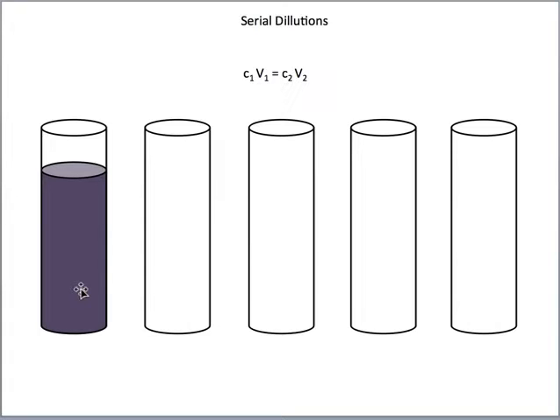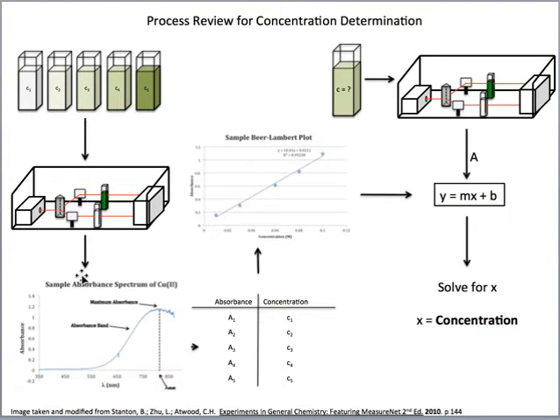Exactly what that new concentration is will depend on how much solvent you add to how much of that original concentrated solution. So you're going to take a little bit of that concentrated solution and you're going to add that to some water. So the right way to do this is to put actually quite a bit of solvent into your volumetric flask. Remember, volumetric flask right here, right?